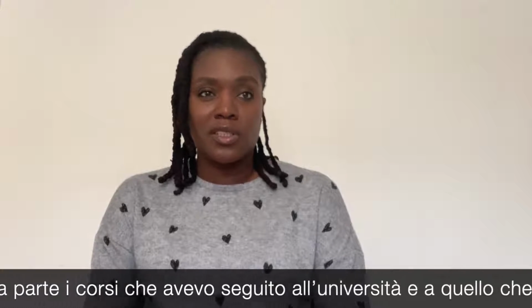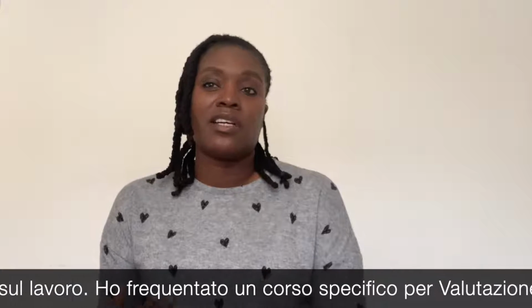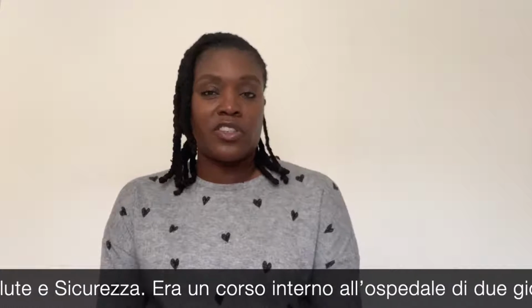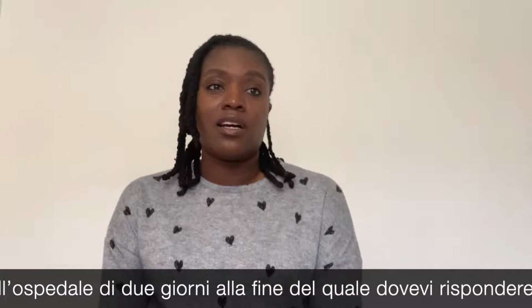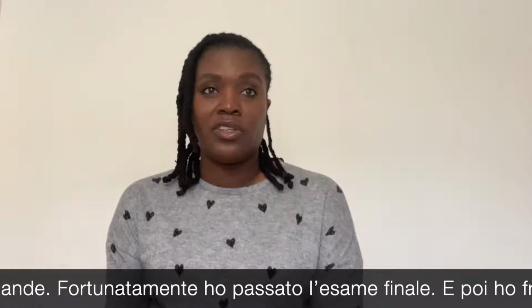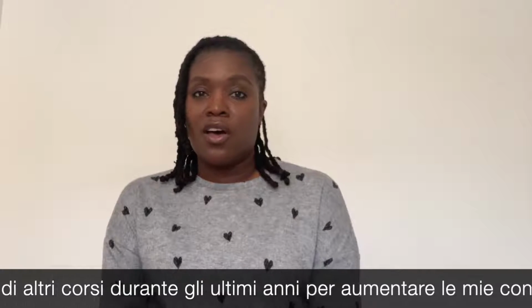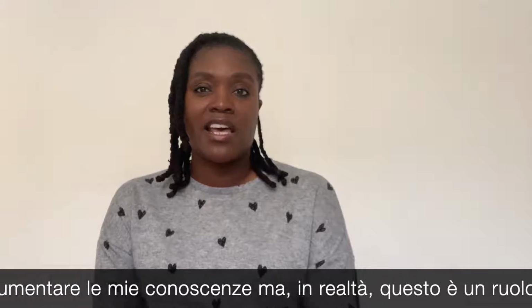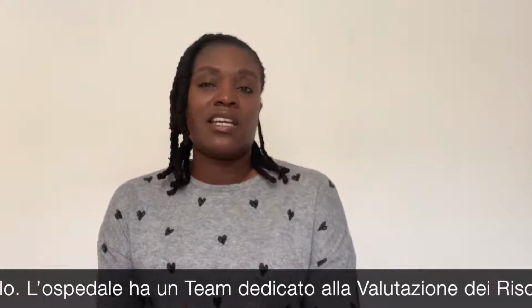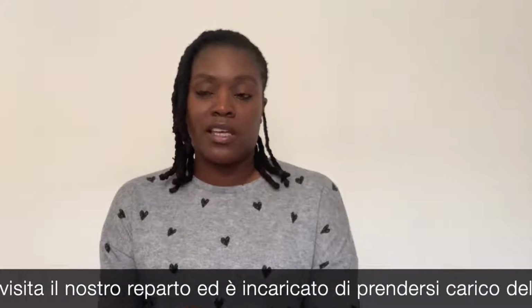I went on a course with risk assessment and health and safety. It was an in-house 2-day course, and then at the end you had questions to answer. Thankfully I passed that. And I've been on various other courses over the last few years. You do top-ups, but really it's a job that you learn as you go along. The Trust has a risk assessment team, so they come in and any specialised issues, it's their job to take care of that.